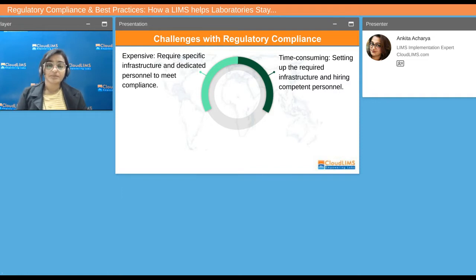Why though? Well, to meet a regulatory compliance, you need to have a specific set of infrastructure and specific personnel who will be dedicated to ensuring that you meet all compliance requirements. To set up the infrastructure and hire the employees is both time consuming and money consuming. Hence, for any laboratory to meet regulatory compliance, they need to ensure these 2 points, that is expense and time.